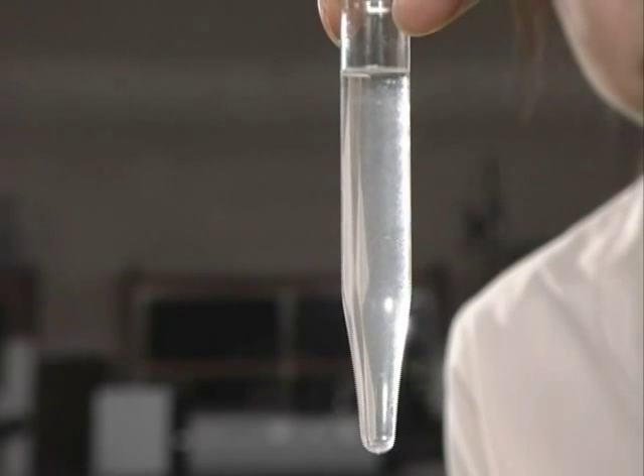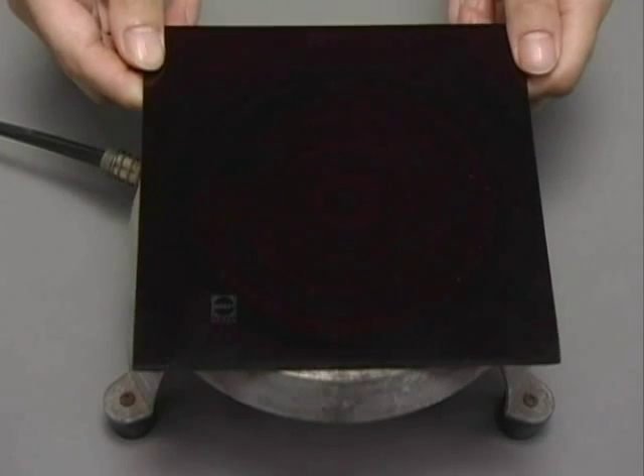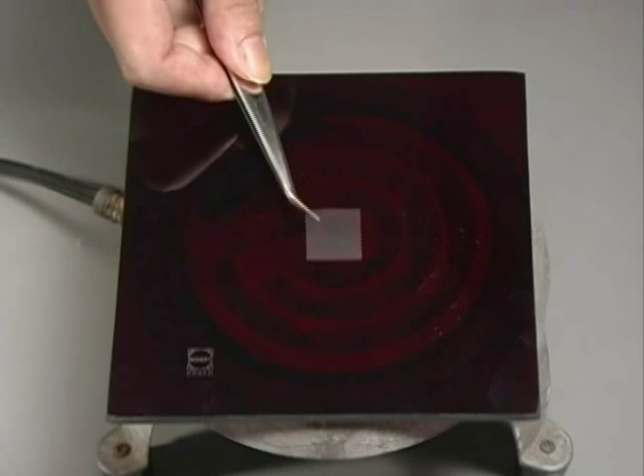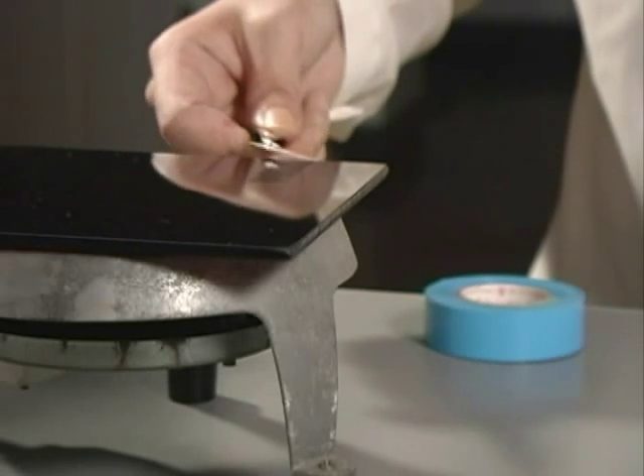This mixture is heated to make the slides. First, place a ceramic tile on an electric heater. On the tile, place a cover slip. Then, place several drops of the diluted solution on the cover slip. The ceramic tile is then heated until the liquid on the cover slip evaporates. After the liquid has evaporated, wait another minute to turn off the heat. Then, carefully remove the cover slip from the tile and place the cover slip onto the slide facing down.